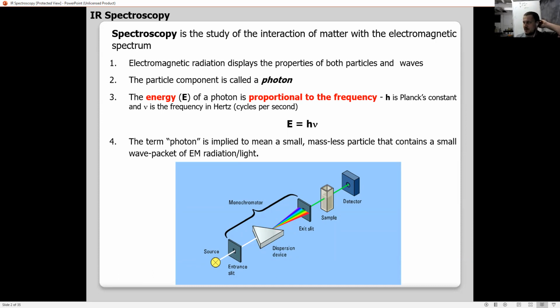infrared cameras, where we look at light. If you remember playing Call of Duty and the thermal scope, what you're actually looking for is the infrared radiation being given off by the heat source. So that's what we're using with this method. And it's not perfect. There are other methods like NMR that have been used or are used as well. But this is quite a simple, cheap option.